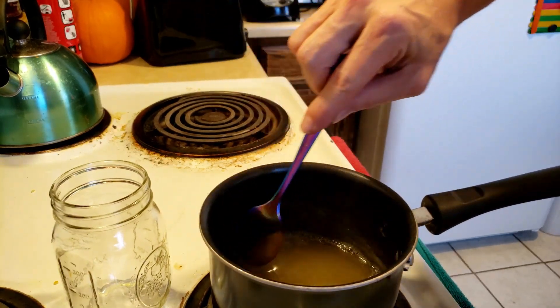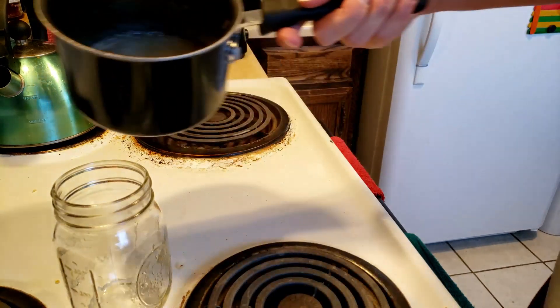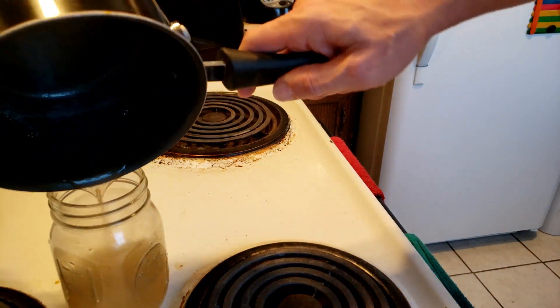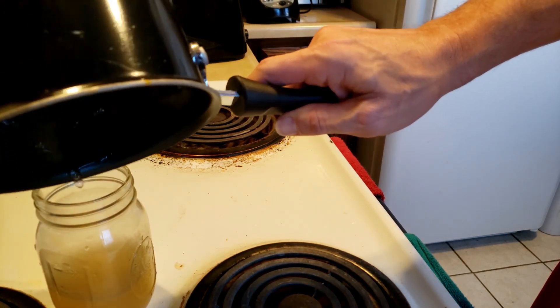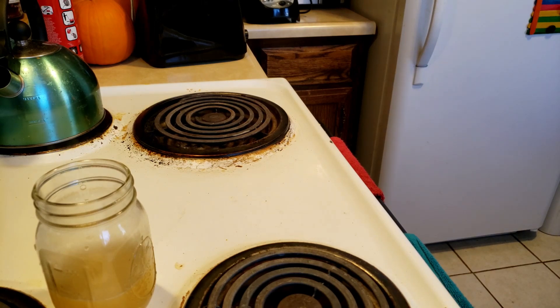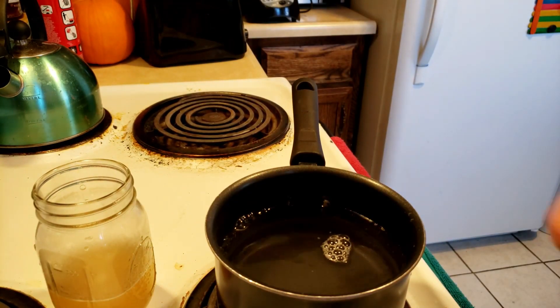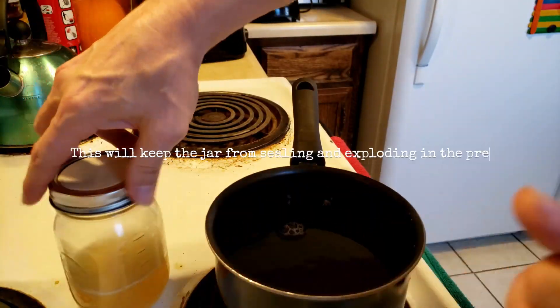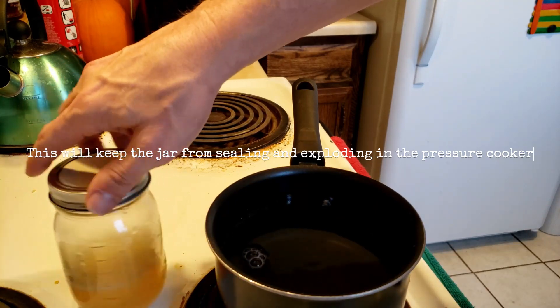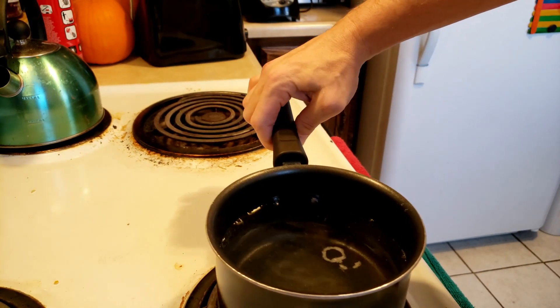Once this is done we're going to pour it back into the jar. We're going to go ahead and fill the pot up most of the way with warm water and set it so that it can take care of the agar that's stuck to the sides. We're going to flip our lid around so that it's upside down and put it back on our jar — just finger tight.